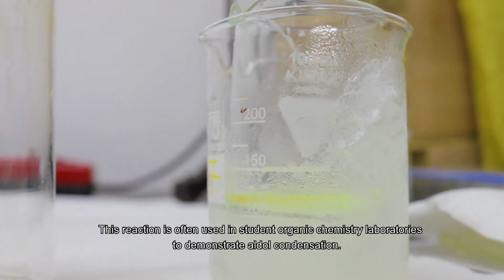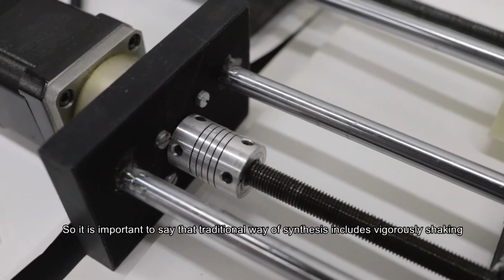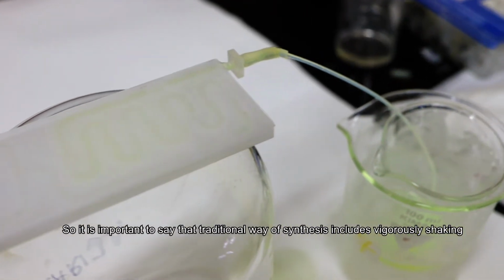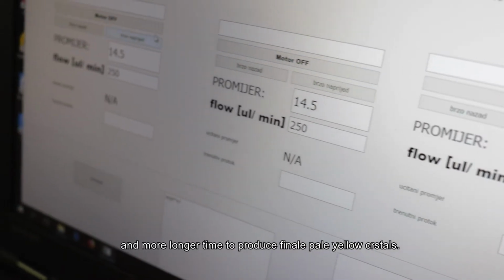This reaction is often used in students' organic chemistry laboratories to demonstrate aldol condensation. So it is important to say that the traditional way of synthesis includes vigorous shaking and a longer time to produce the final pale yellow crystals.